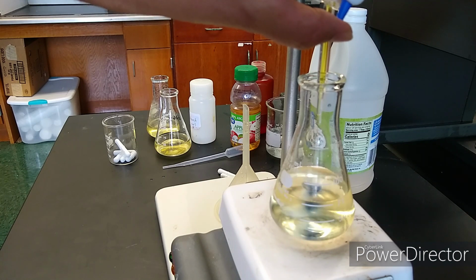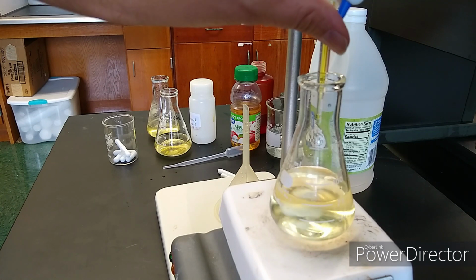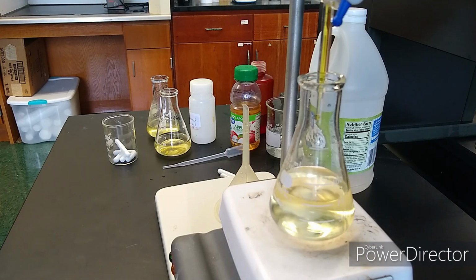So those drops are going out pretty quickly. I can slow the drops down. Now this would be a very slow drop rate right there. 1, 2, 1,000, 3, 1,000, 4, 1,000, 5, 1,000. See, that's the joy of titrations, is the slow, patient waiting for the end point. Drop by drop by drop. Oh, there's another drop. Oh, you see that purple color though? It disappeared right away.